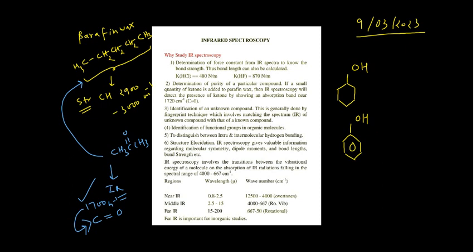If we have some confusion about two different kinds of compounds that look the same, we can run their spectra in the fingerprint region, and that will give you different spectra for different compounds. You should remember this point.